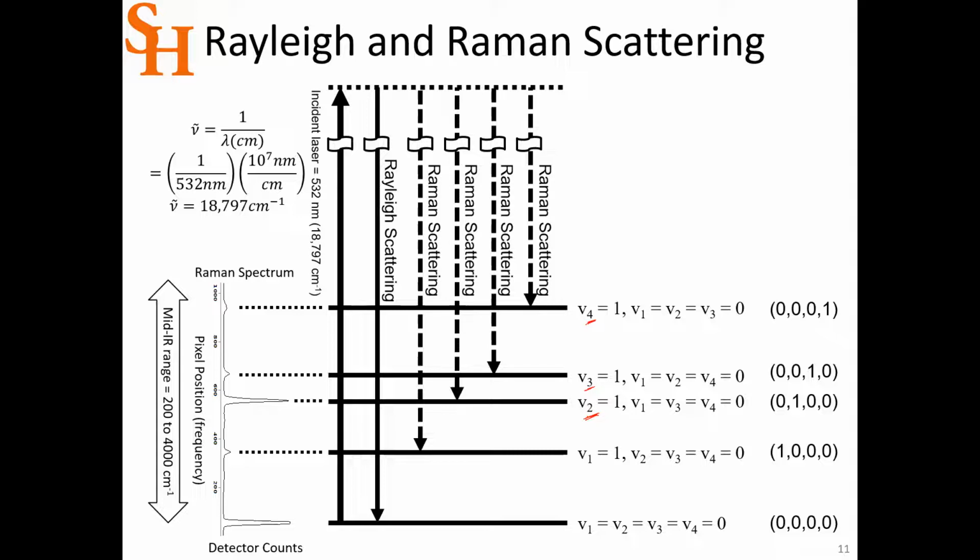And then we want to see how well the simulation for benzene matches the experiment. So we'll have the simulated for benzene and the experimental for benzene. And so that's another 4 spectra. And then we have the simulated and the experimental for chlorobenzene. So you're going to have 4 stacked plots. That's 16 spectra. And once you learn the first one, then the next 3 are pretty easy. Okay. So that's what I've done.